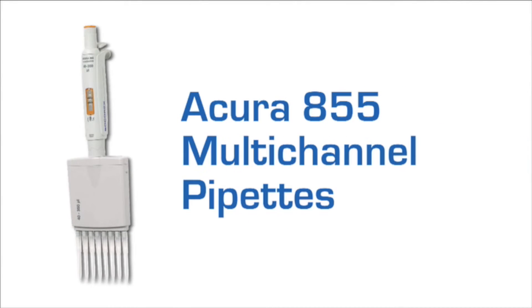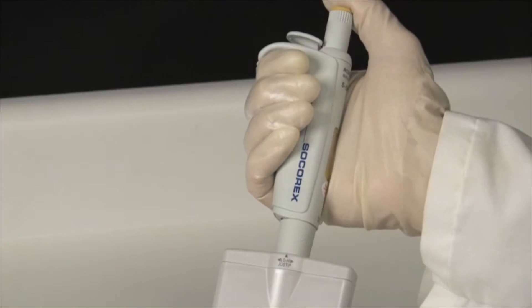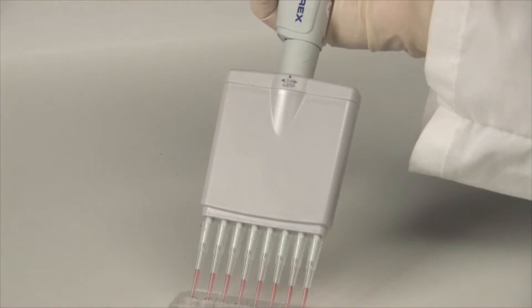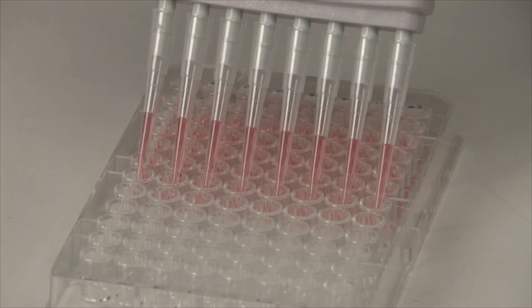The Acura manual 855 multi-channel models come in both 8 and 12-channel models to enable high-throughput pipetting with microplates.